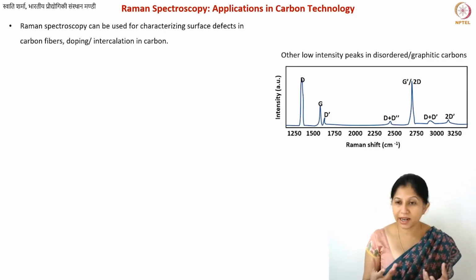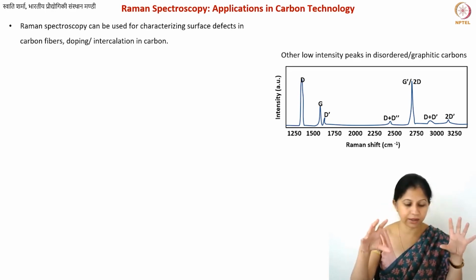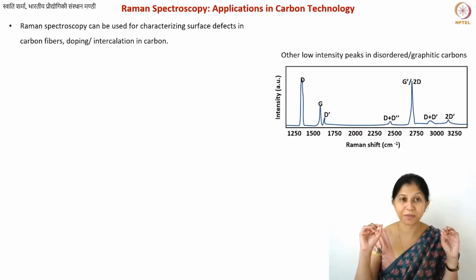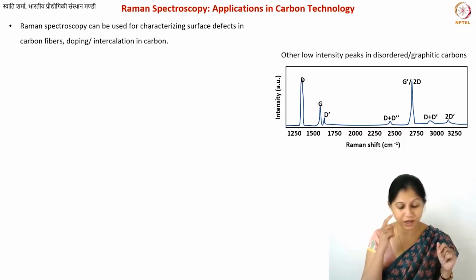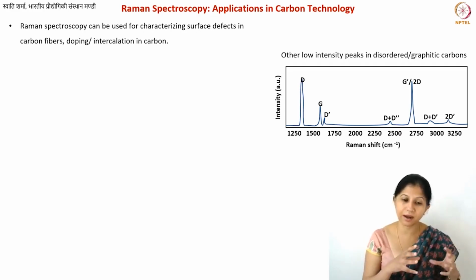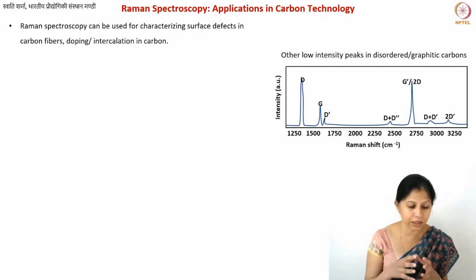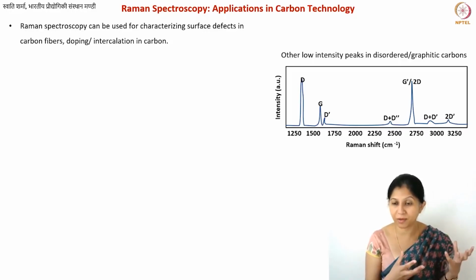Okay. So intercalation compounds basically cause some deformation or some curls, and sometimes also defects in your material. Defects can be very nicely understood by Raman spectroscopy, but of course in that case your starting material should not have the defect. So you cannot understand intercalation materials, or you can, but it will be very difficult to understand intercalation behavior in the case of disordered carbons, because you already have a lot of characteristic defects in disordered carbons, and then you will also induce some more defects because of intercalation.